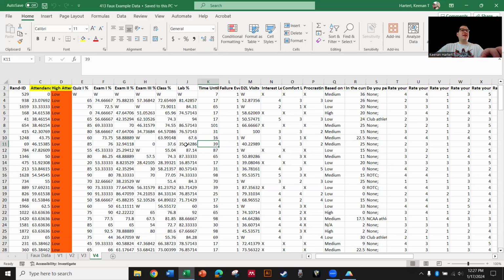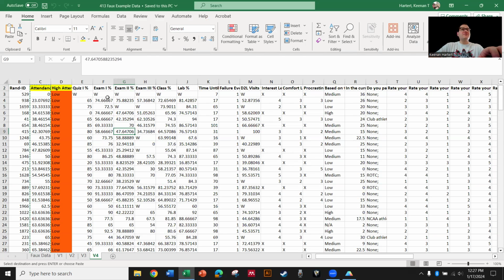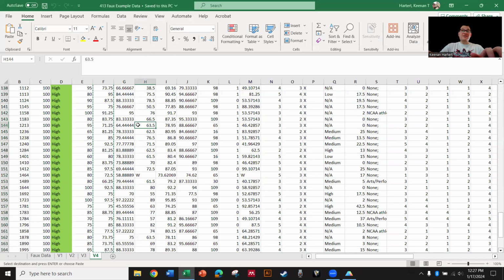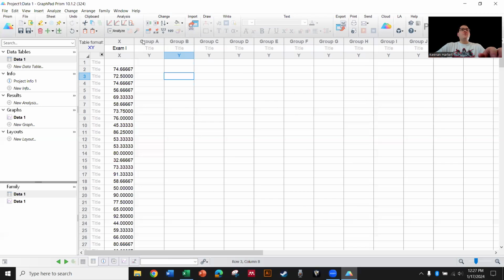All right. Well, let's try something obvious. Let's say that the attendance is the X value. Oh, I'm not going to do attendance because there's too many hundreds. See that? That's going to be ugly on the end. Let's do exam one. Can be our X value. Oops, and that W person is going to cause me some trouble there. Let's see if I can't insert and then shift cells down. Yeah, okay. So I'm going to say exam one. So that's our X. You can only have one X value. Notice that. Here, I'll just do the full thing so we can see it. We'll be able to add more Y values, but we only will have one X value in this case.